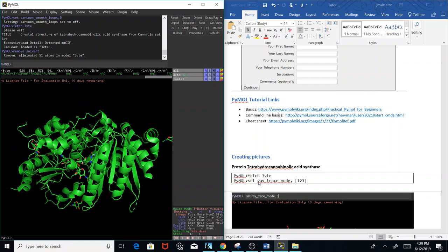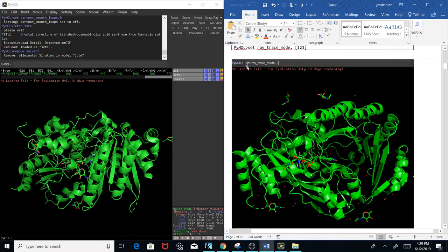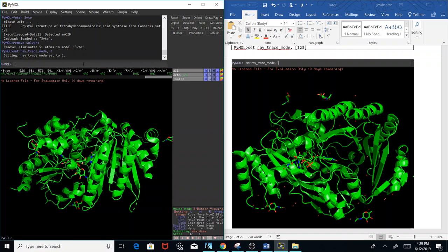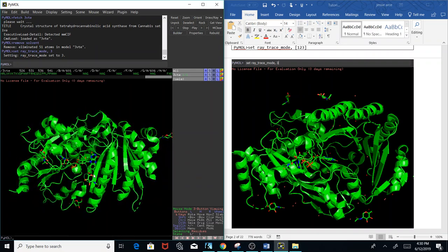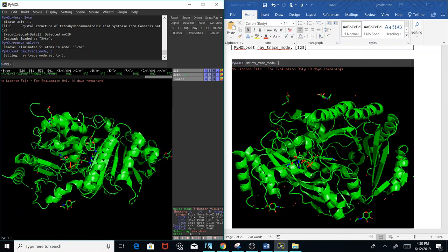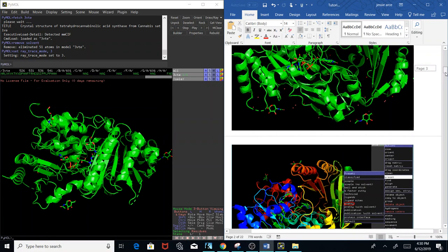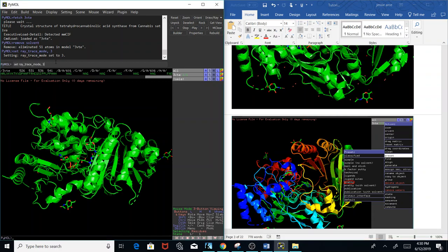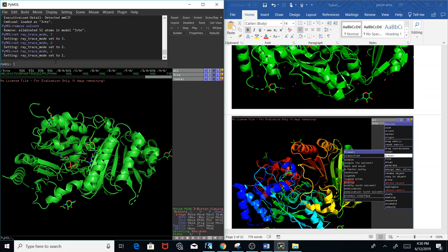We can use raytrace mode. There are modes 1, 2, and 3 that set different color quality. In this example I'll use raytrace mode 3: 'set ray_trace_mode, 3'. Notice how the quality of the color changes — you get more shadowing and a more appealing look. There are different modes you can set; here's mode 2 and mode 1. I like mode 3 best, but you can change it to whatever you want.